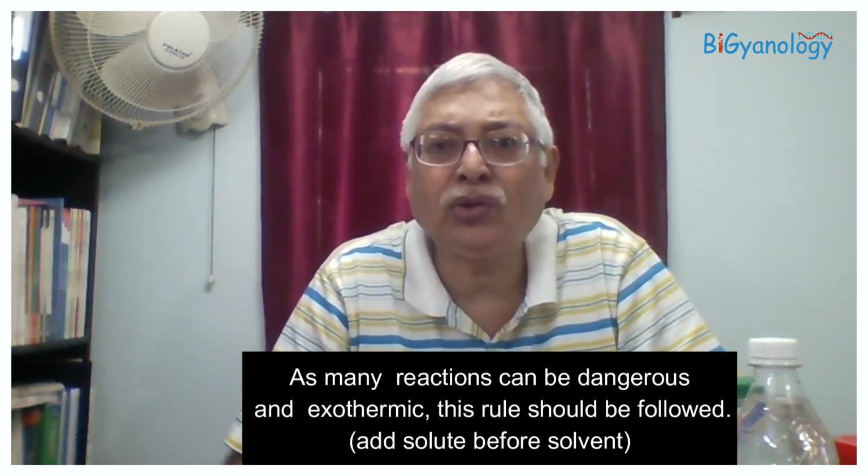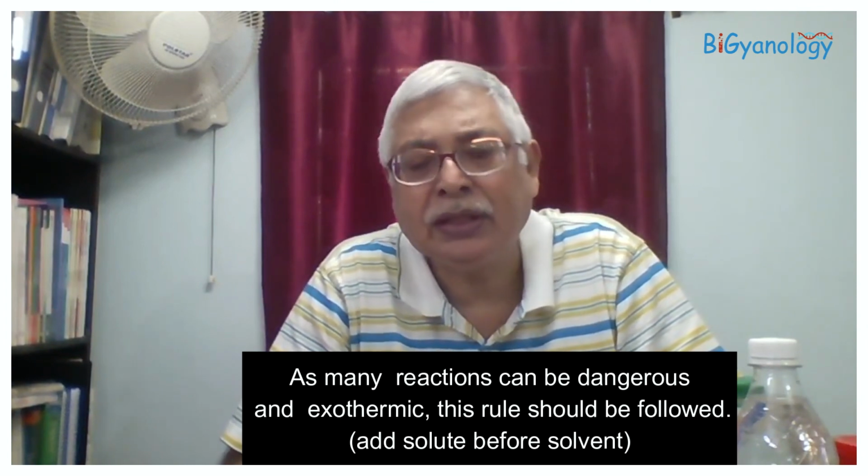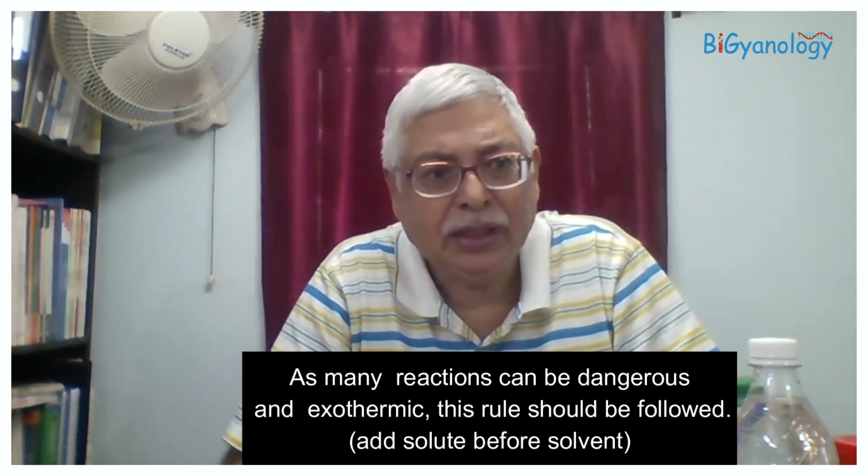Whenever we mix any solution, there are some rules in chemistry: the solute should be given before the solvent. Here water acts as solvent, so we will not give it first. We will pour the solute first, then mix, and then we will give the solution.